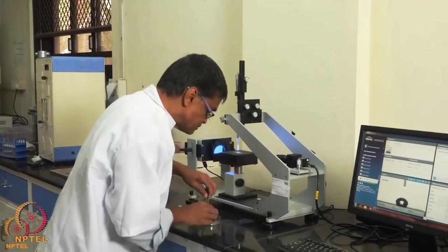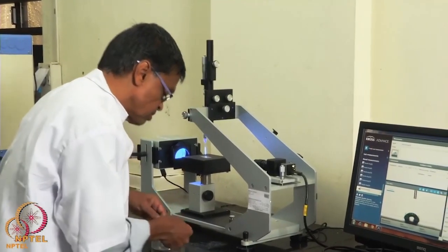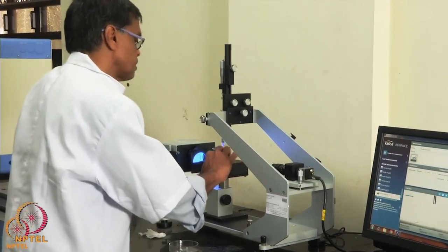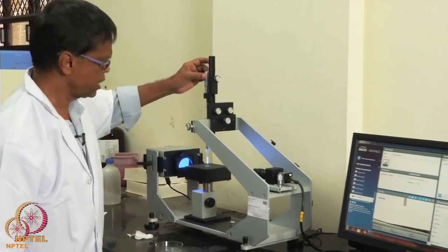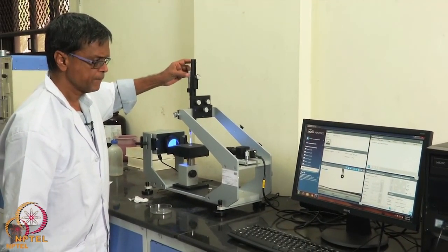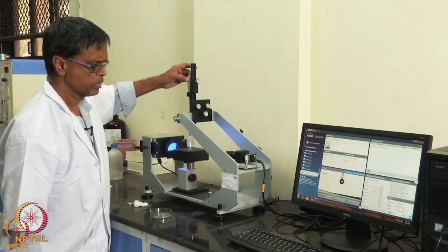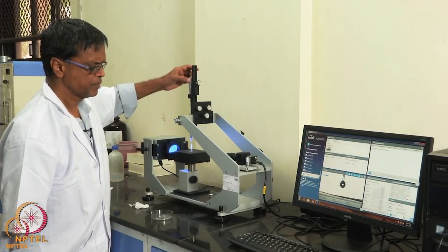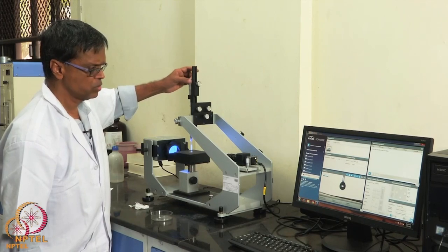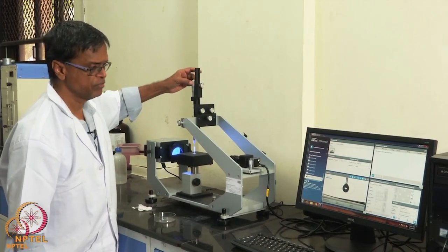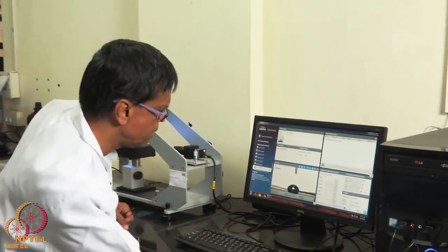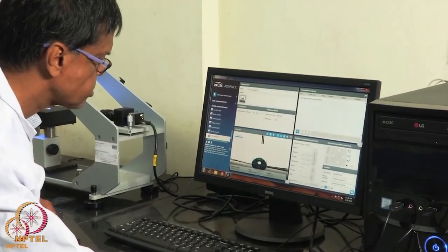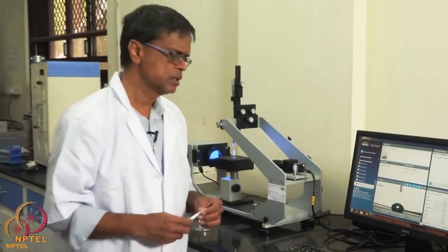Let me try out another sample. This is another polymer — PVA. Again I make a water droplet. As I keep turning the knob clockwise the drop comes down slowly — you don't want to let the drop fall and splash. You can see the drop makes an angle of around 72–73 degrees with respect to the horizontal.